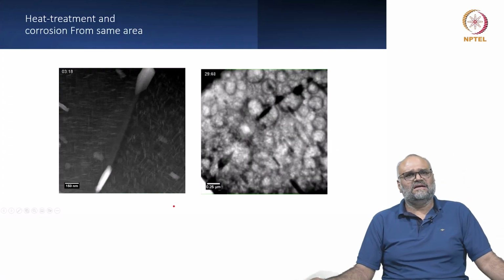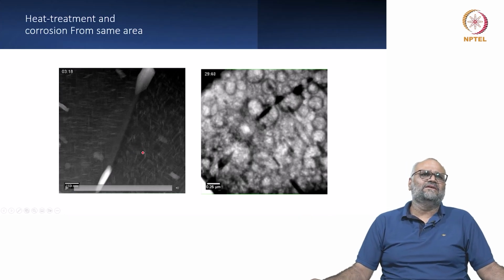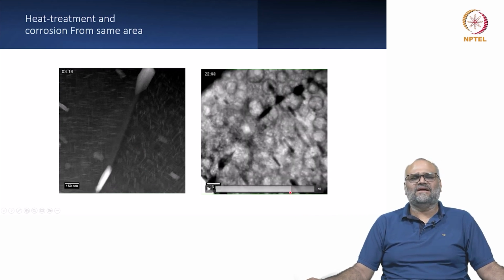Because in this particular case, the precipitates that are formed are sticking close to the surface, you see there is a significant surface attack.